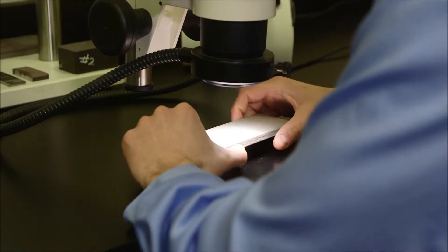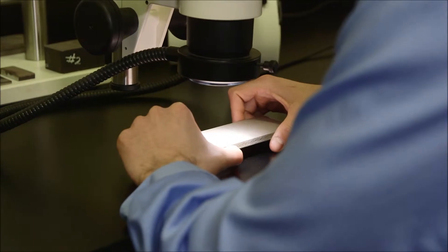Or if there's any other features on the component such as stress indication lines or deep grooves that might be in the surface, this microscope allows us to identify what those are before we decide to take it to the next level and go into SEM analysis.